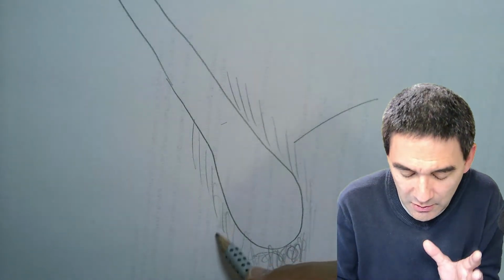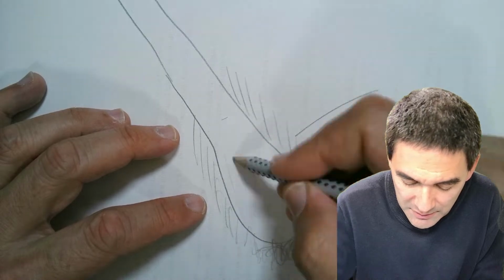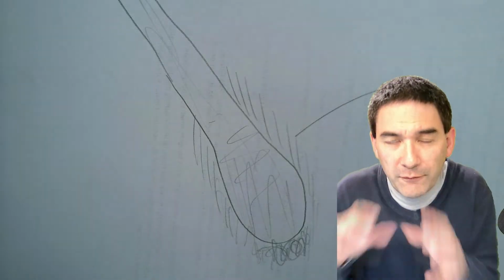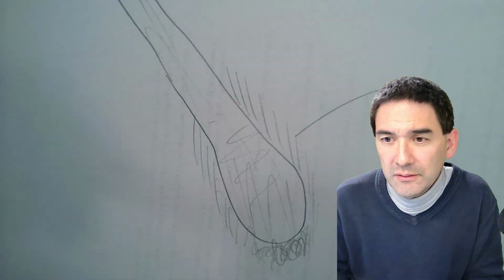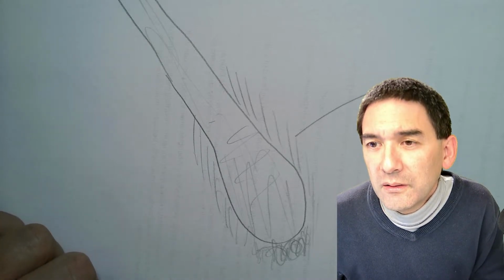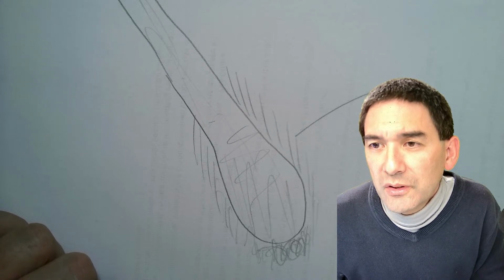And the actual hair is on the inside. Okay, and we would say that this is kind of the hair root, and the follicle is basically on the outside. These are the cells that actually make the hair. So that's very briefly. I think that there are no more questions.